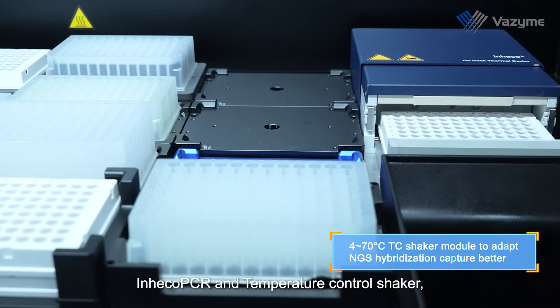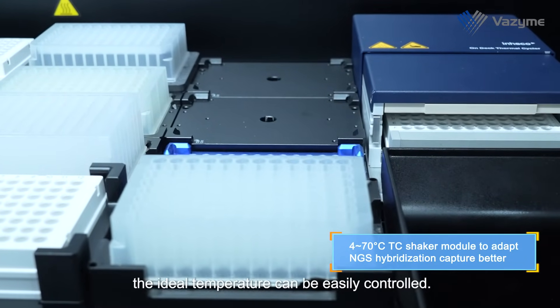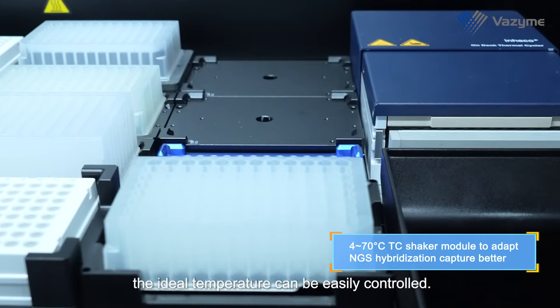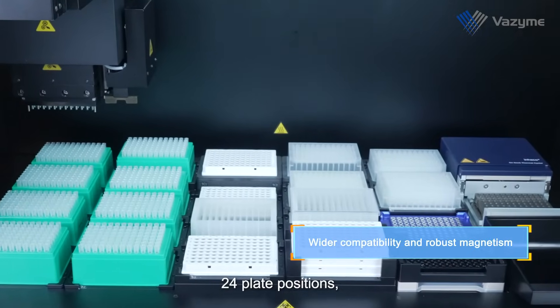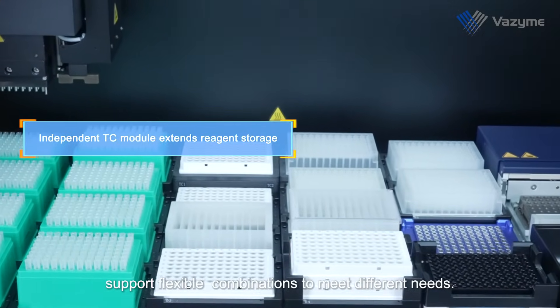In HECO PCR and temperature control shaker, the ideal temperature can be easily controlled. 24 plate positions. Support flexible combinations to meet different needs.